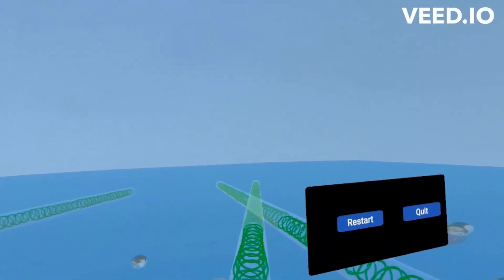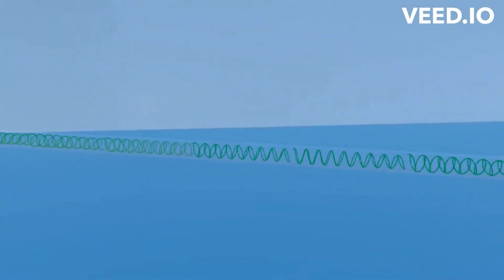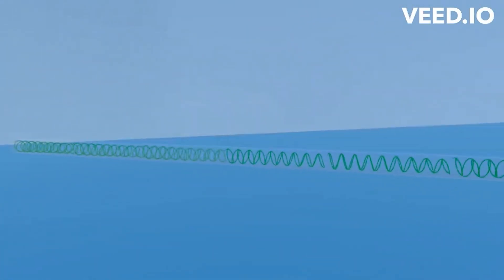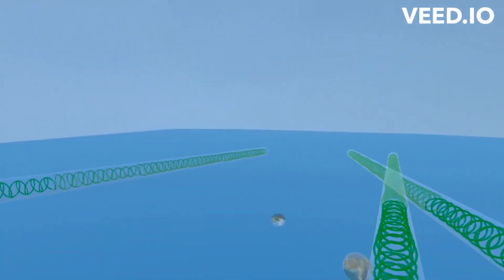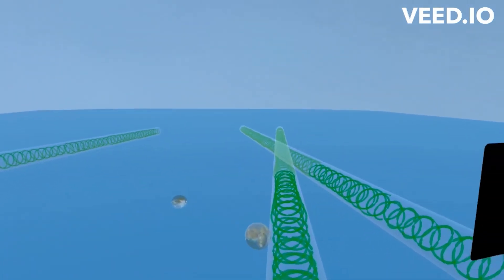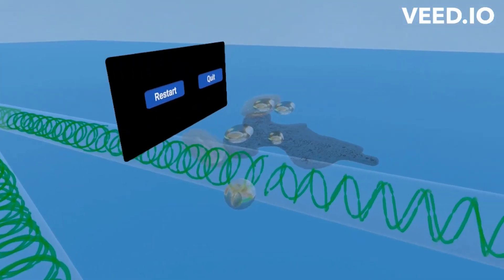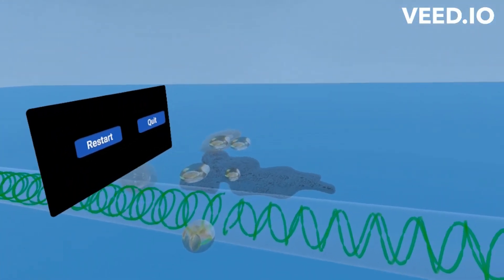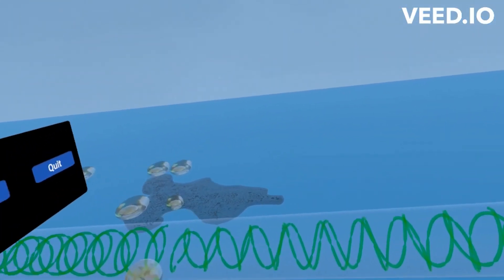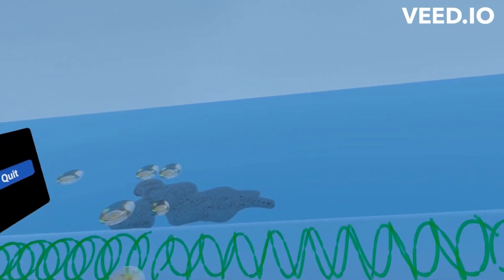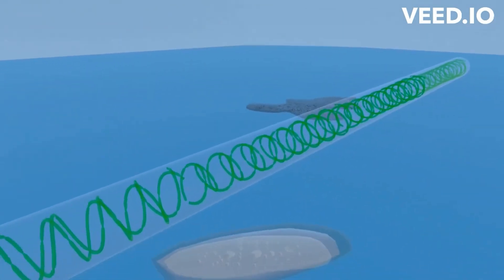The microscopic examination of pond water typically reveals a diverse array of microorganisms, including various species of algae, protozoa, spirogyra, bacteria, and microscopic multicellular organisms, collectively comprising a complex aquatic ecosystem.